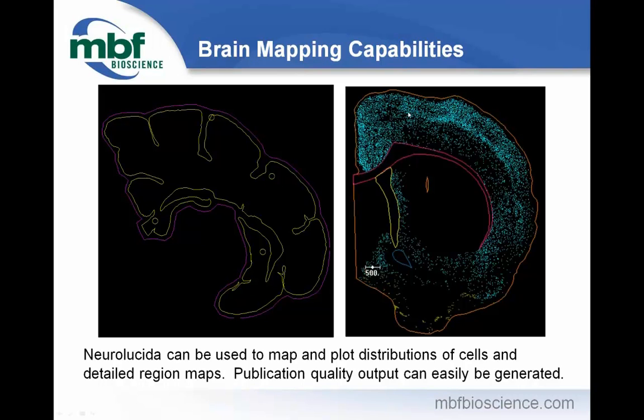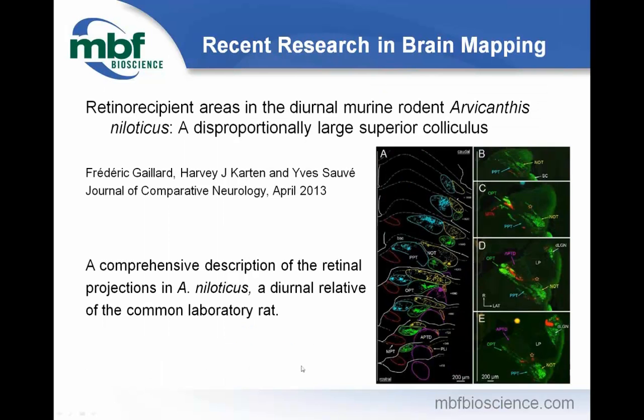We're using this method, this brain mapping, in order to guide more detailed analyses later on. And so in this case, we may be more interested in representing that there are many more cells labeled in layer 2, 3 than in layer 5, for example. I gotcha. So if you are interested in an absolute number of these cells in various regions of interest, you may consider using a different technique, stereology, for an unbiased estimate of the total number of your cells in your region of interest.